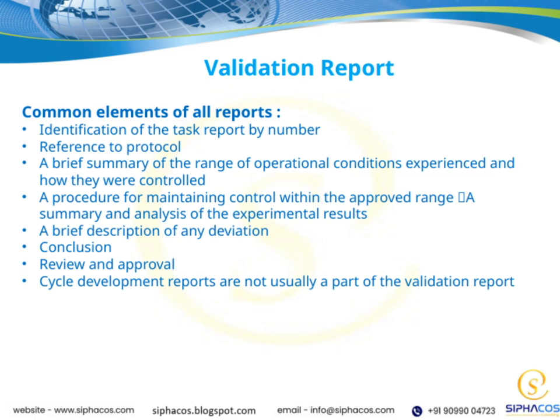It's important to note that cycle development reports are generally not part of the validation report, as they serve a different purpose. Altogether, these elements form a comprehensive and structured way to present validation data, ensuring clarity, traceability, and confidence in the results. This consistency across reports supports the overall integrity of our validation process.